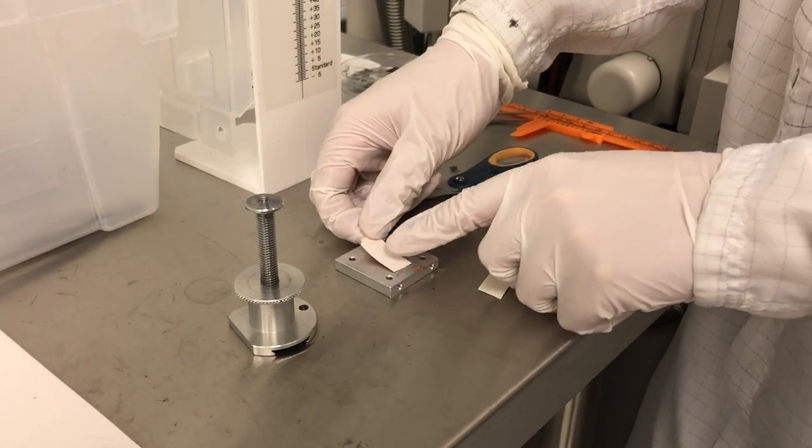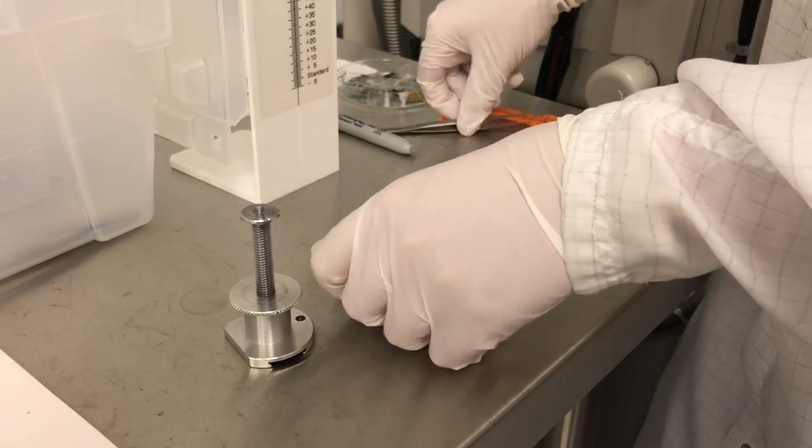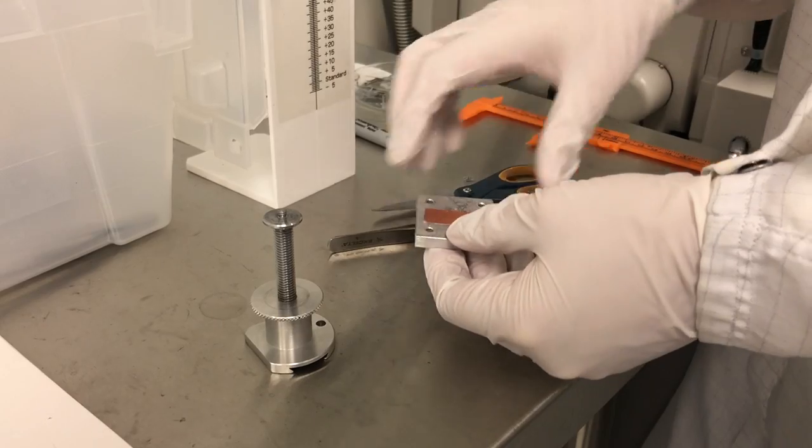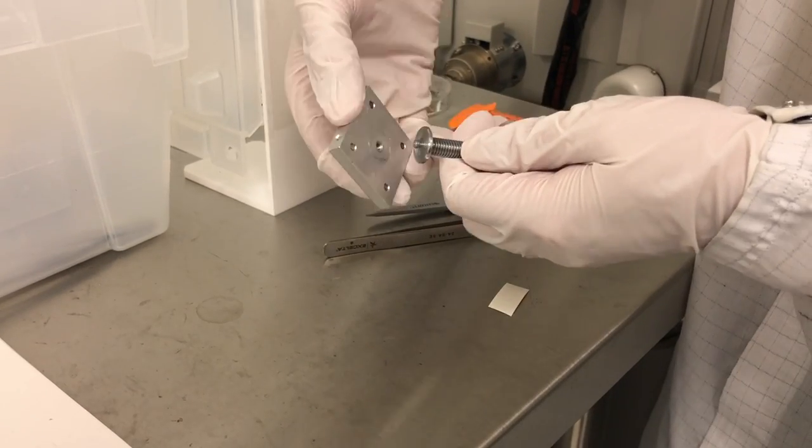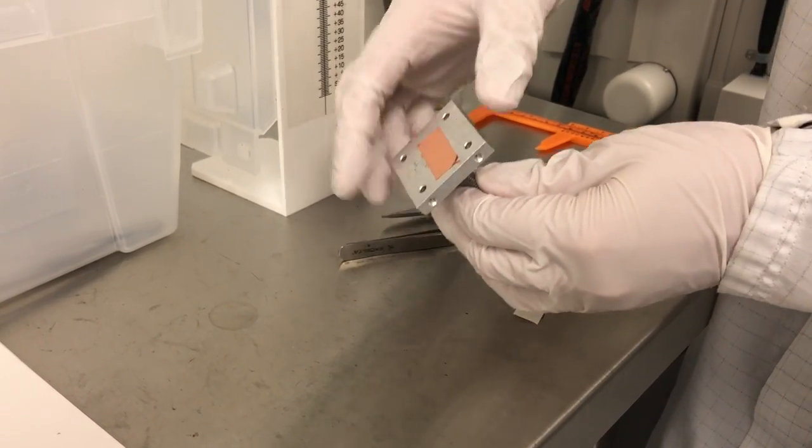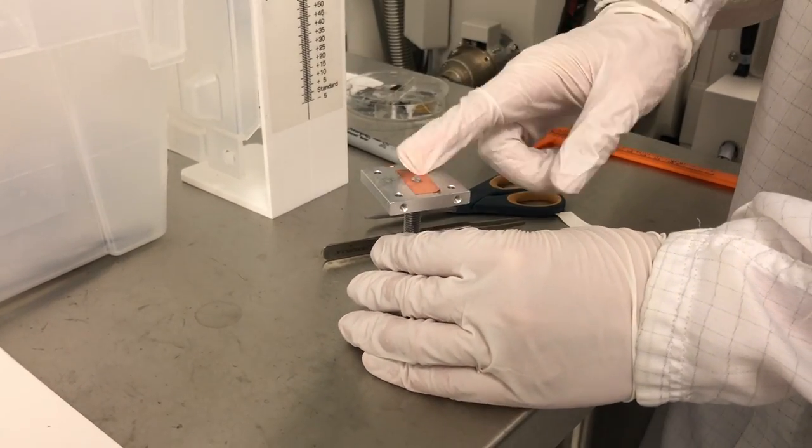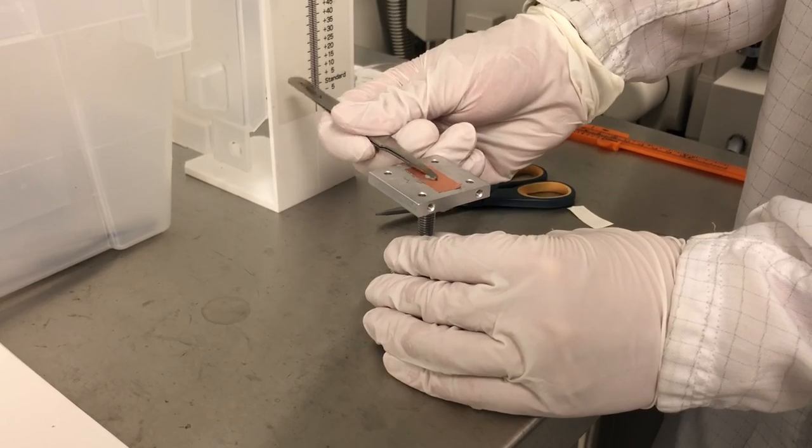If your sample is non-conductive, you will need to sputter gold or carbon onto the surface of the sample unless you are using the VPSCM vacuum setting. The sample may be attached using either the copper tape provided on the table opposite the SEM or with carbon dot tape. Ensure that plenty of adhesive is used. There should be no air or gaps between the sample and the stage.